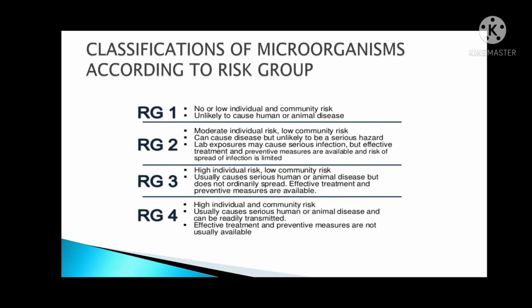Risk groups are classifications that describe the relative hazard posed by infectious agents or toxins in the laboratory. The risk group to which an infectious agent or toxin is assigned is a primary but not only consideration used in a biological risk assessment to determine the appropriate biosafety level in which a worker can handle the infectious agent or toxin. Just a reminder, risk group levels do not always correspond to biosafety levels.